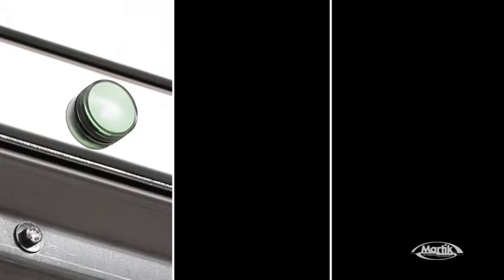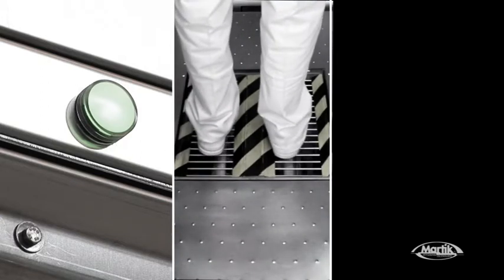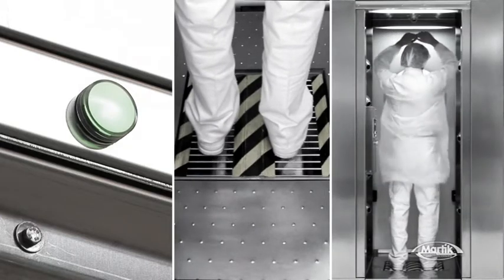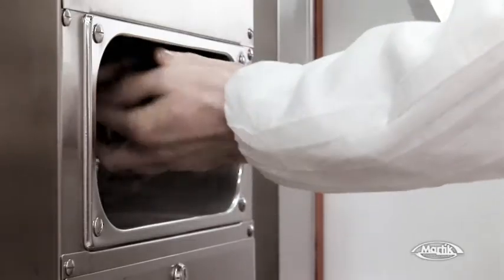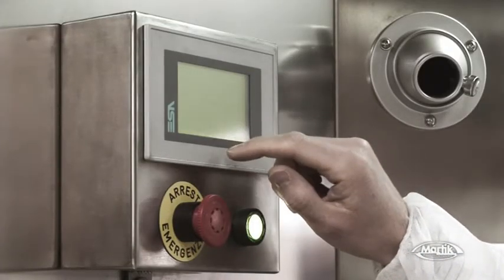Before entering the air unit, just make sure the warning light is green. Then the pressure exerted by your own weight starts both instant shoe sole cleaning and air blast decontamination. The sanitation step is complete after you put your hands into the nebulizer to have them disinfected. All the operations are monitored by the control touchscreen.